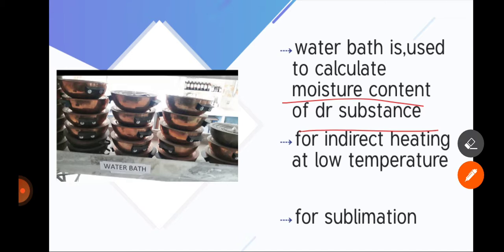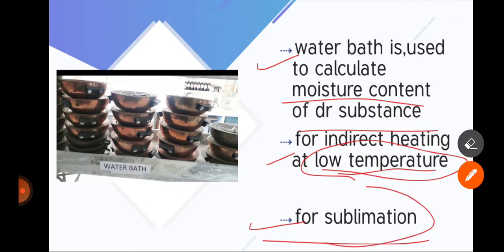For indirect heating at low temperature and for sublimation, these three things we need water bath for: moisture content of the substance, indirect heating, and sublimation. Sublimation is when solid substance directly converts into vapors without coming to the liquid state.